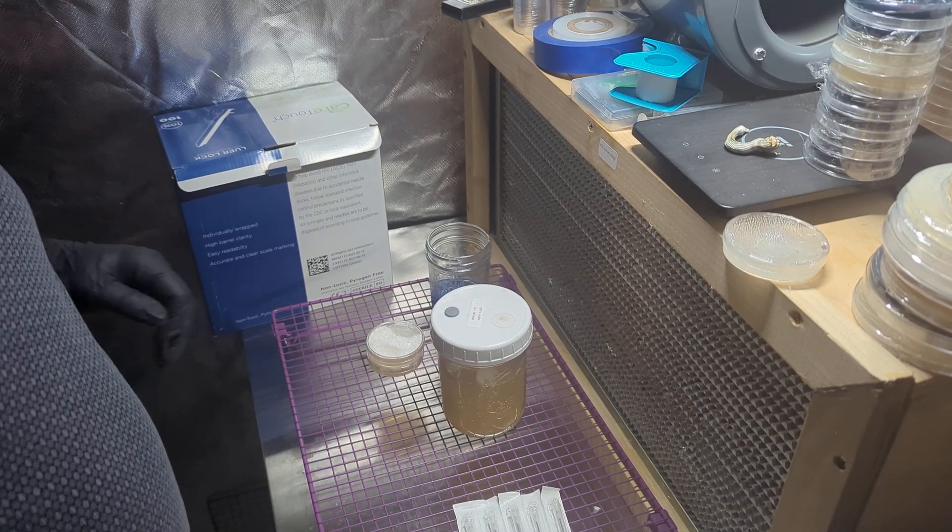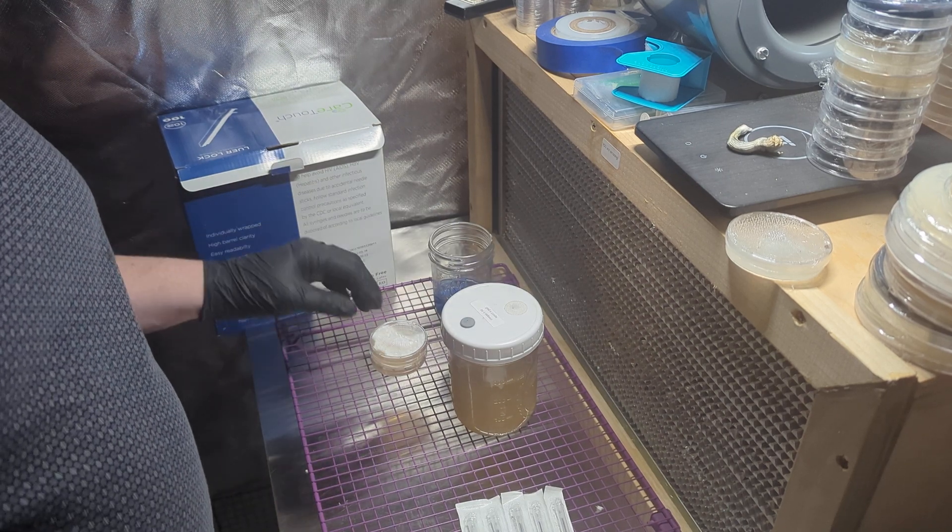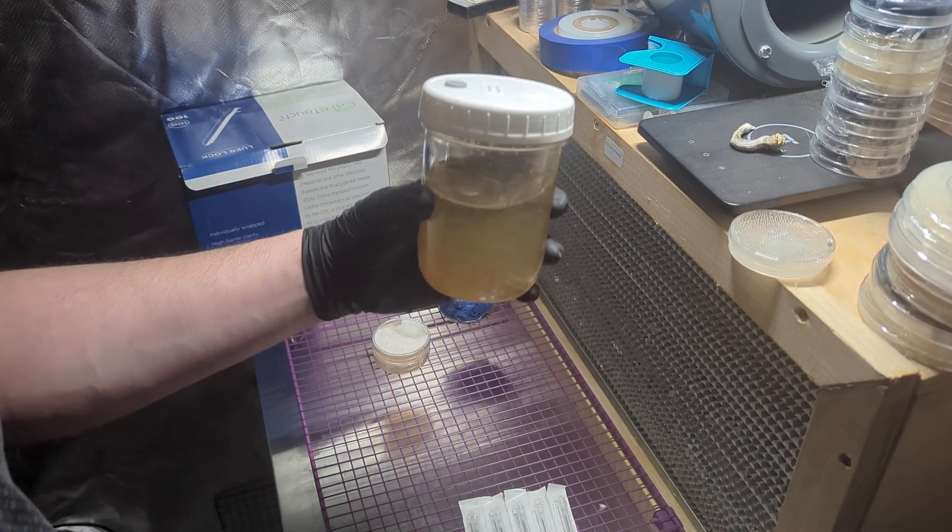Welcome everybody to Lab Sessions with the Rye Guy. I am Rye and I'm going to be extracting some LC today.